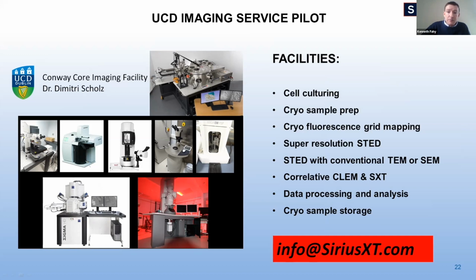Several potential workflows are available at Conway, such as, in addition to soft X-ray tomography, correlation of super resolution STED with conventional TEM or SEM, as well as ongoing work to integrate soft X-ray tomography into this workflow in the coming months.